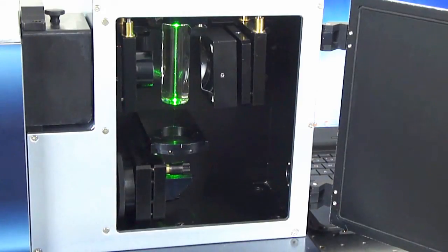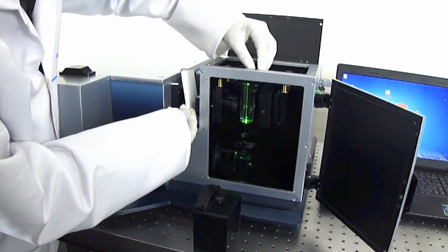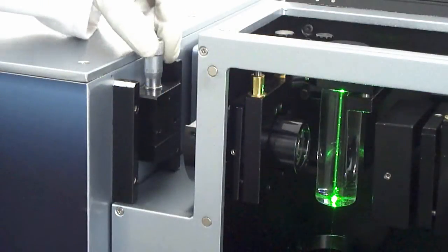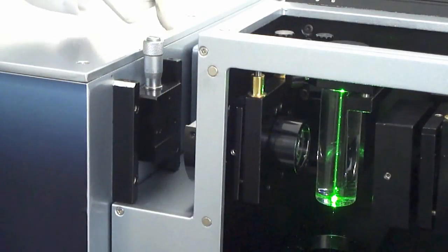The procedure involves illumination of a sample with monochromatic light and examination of scattered light from the sample with a spectrometer.